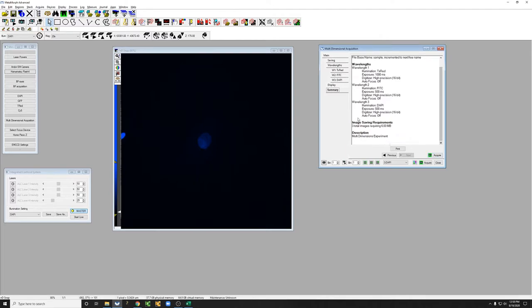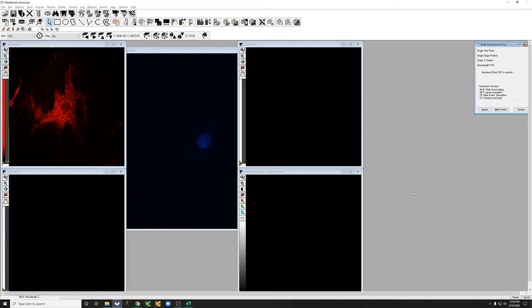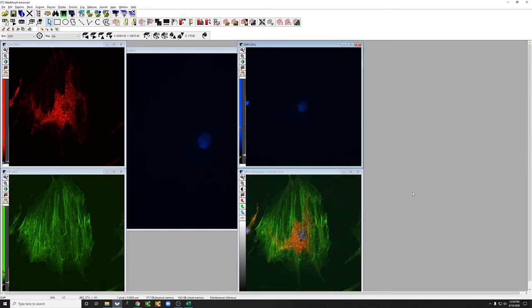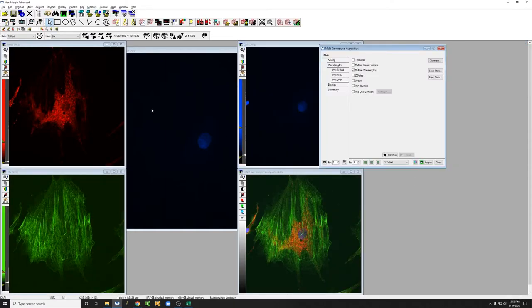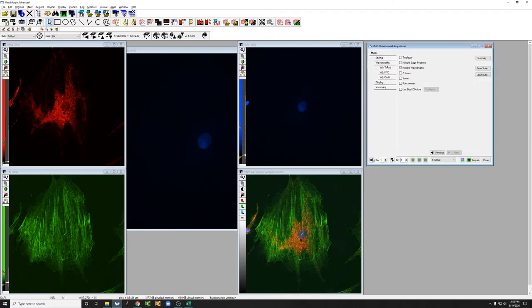So all of this looks good, now I'm going to hit the acquire button and we can see what happens. So you can see it acquired the images for Texas Red, Fitzy, and Dappy, and then showed us a composite.